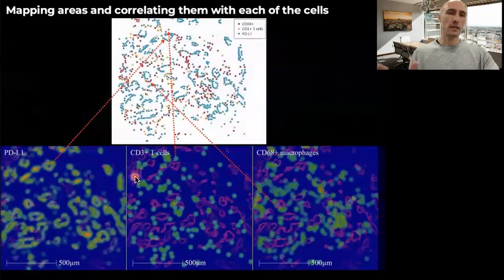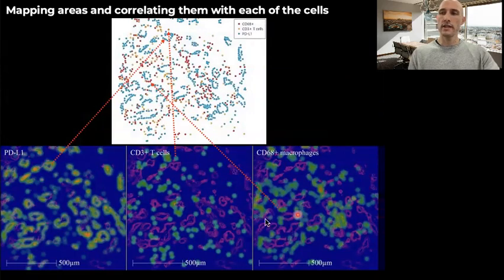And then you can go back to the single cell analysis and recognize where your cells were in this heat map. The amount of analysis you perform will depend much on your scientific question. But once you segment your cells, the downstream analysis will be almost endless.